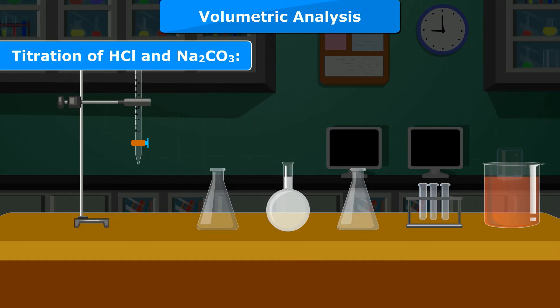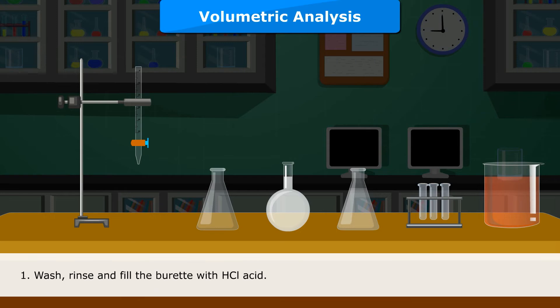B. Titration of HCL and Na2CO3: Wash, rinse and fill the buret with HCL acid.